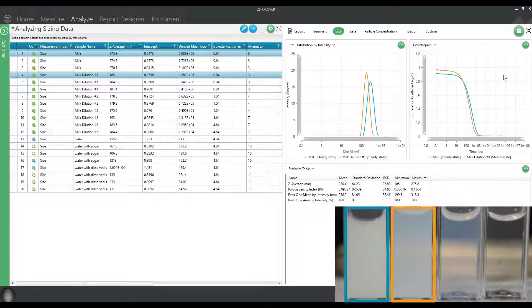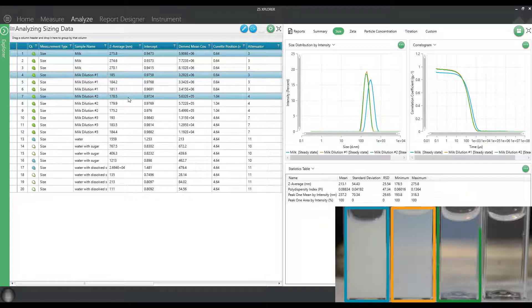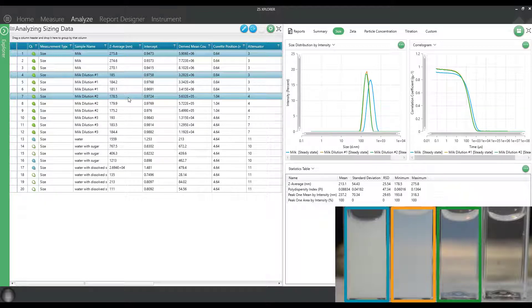Now let's just for fun do a couple more dilutions and see where things go. So let's display the dilution number two. And at that dilution, now you can see we have the exact same sizing results. So now we can feel pretty confident that we're in the proper concentration range for getting good quality data for this sample.